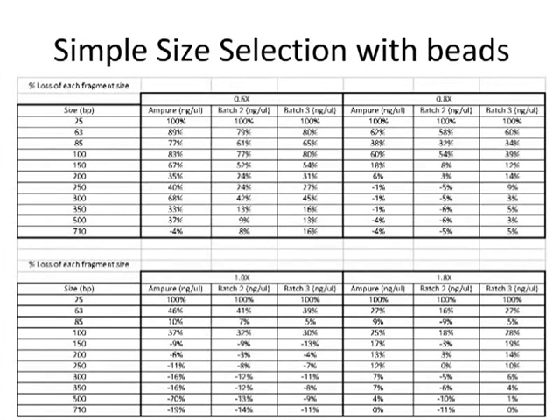I should point out, very importantly, that this is not the same methodology that Beckman is using in their automated size selection step that I showed you in the SPRIworks HT. This should most appropriately be considered a relatively crude methodology of doing size selection, but if it gets you the results you need, it actually works quite well.